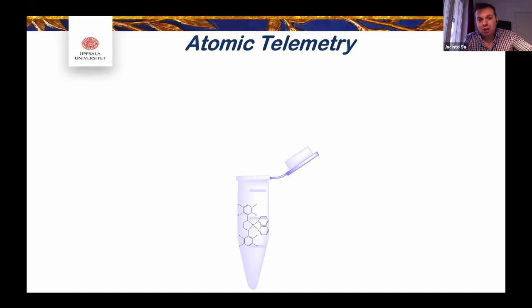And since we don't have that much platinum in our body, unless you had some kind of implant, it is almost background free. So you sit on that central atom and you see what that central atom does. Of course, if the central atom starts reacting with a lot of other components in your cell, in your blood or in your membranes, that will also be picked up.